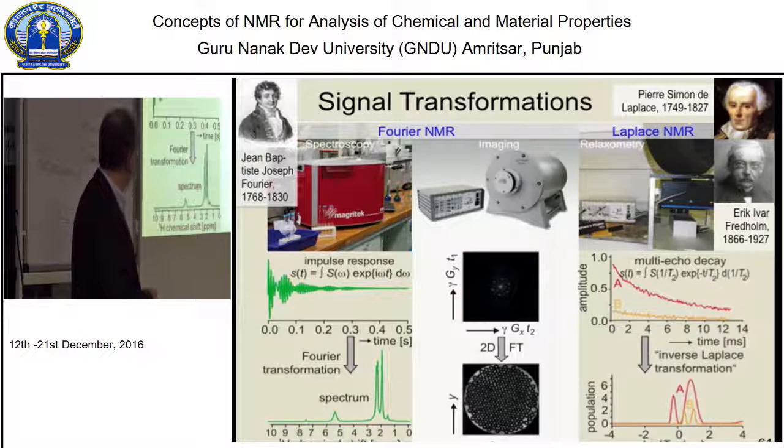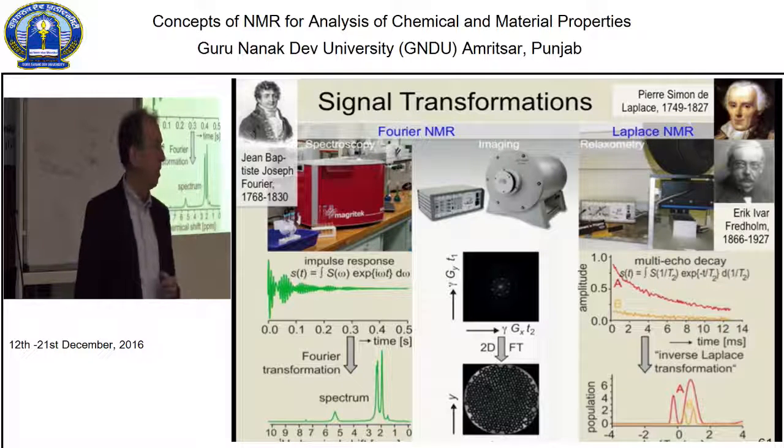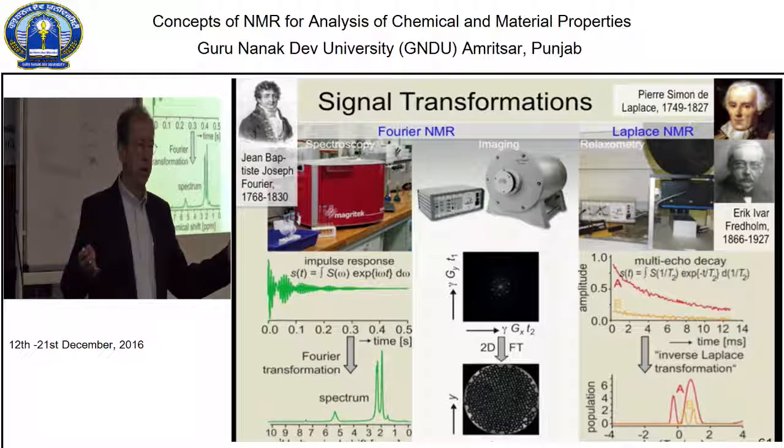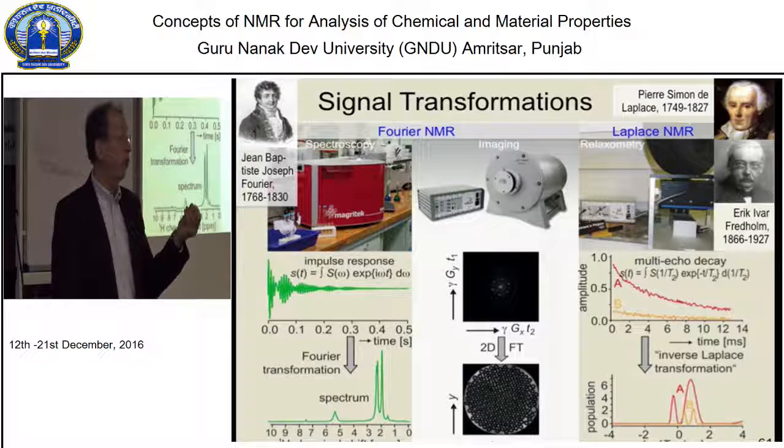So there is a very interesting similarity. This is a new type of NMR, actually it's not new, but looking at it in that way is new. It's only something that has really developed in the last 10 years. And it has enriched magnetic resonance spectroscopy tremendously by drawing a lot of the experience people have collected in spectroscopy.